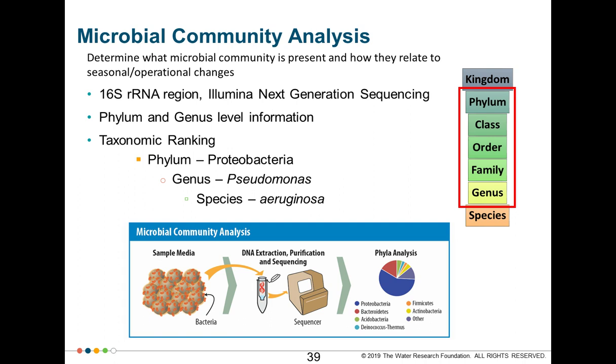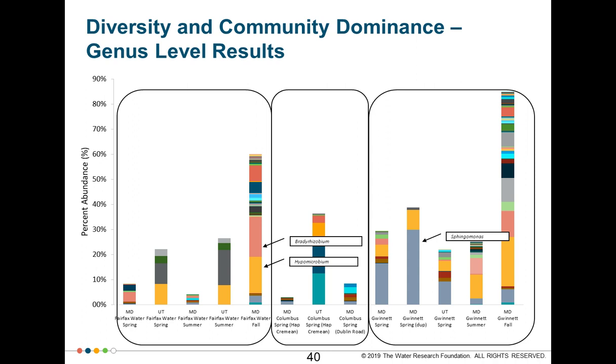That can be really critical when you want to look at pathogen identification, and even going beyond that, there are specific types of species that are related to pathogens. So we were not looking at pathogens. We were only looking at diversity of our samples. Now when you do a study like this, you get a ton of data, and we compare data from 2 labs. And what you see is basically the abundance, so the percentage of a particular genus or phyla that's present in your sample. So I'll show you what that data looks like.